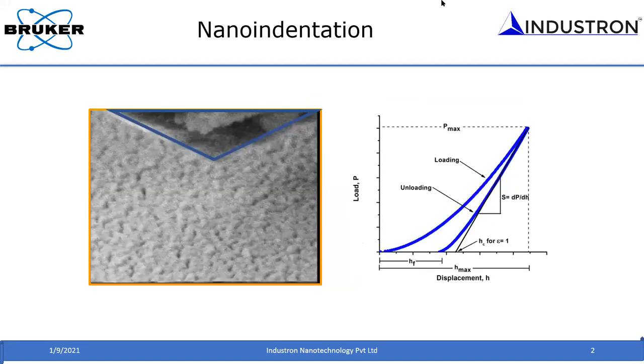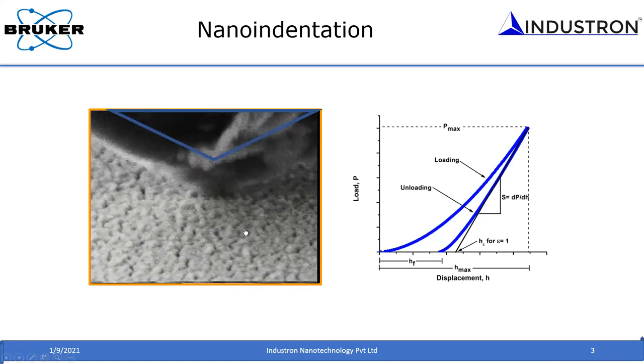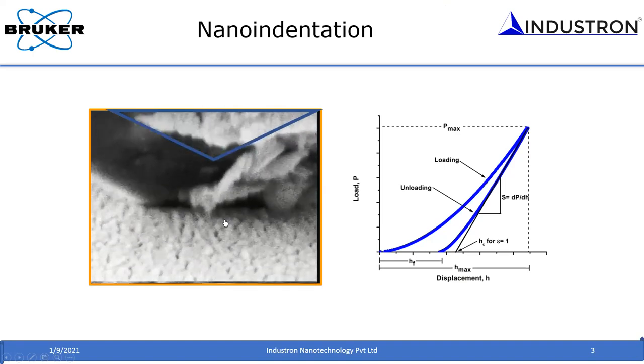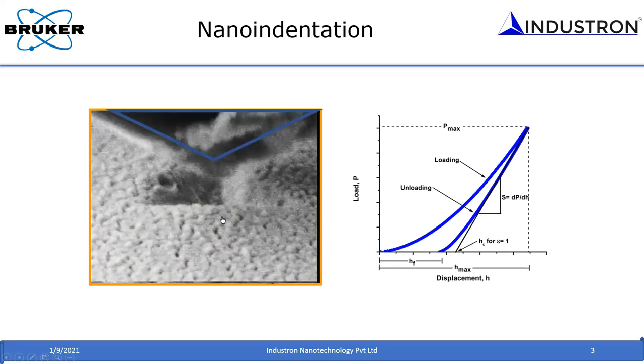Okay. So next, I think Pijush gave a pretty nice animation of nanoindentation. I would like to show that in real life, this is done inside a scanning electron microscope. So I'm going to show a video of this nanoindentation, where you can see there is a diamond tip approaching and making contact on a sample beneath and doing an indent. By loading and then unloading, it leaves a small dent on the surface. This is what we call nanoindentation.